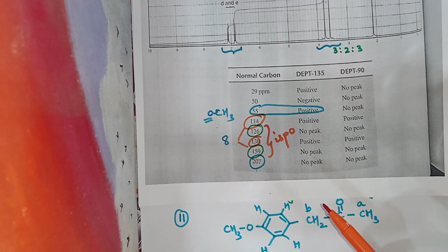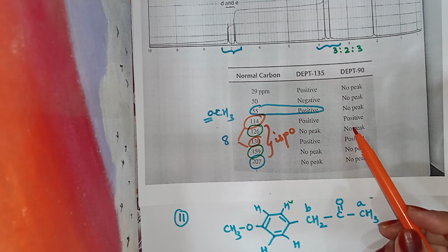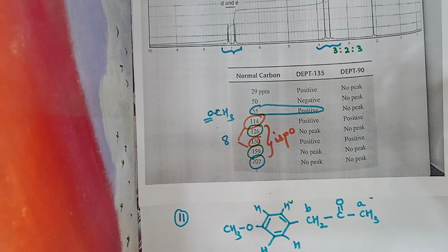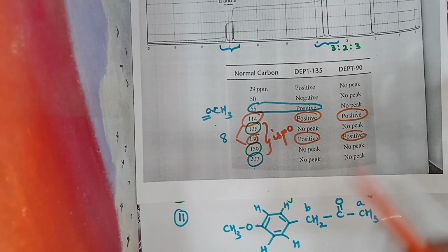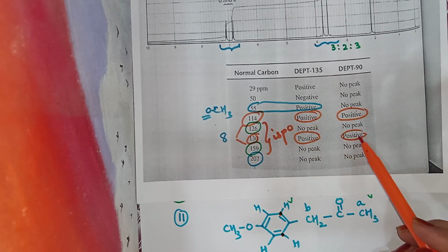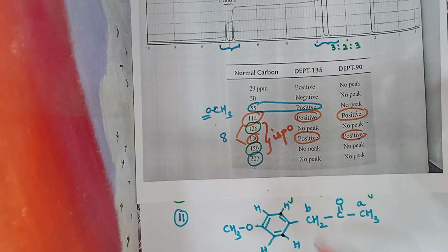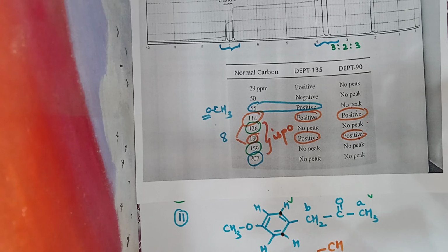The 2 carbon atoms D show peaks in both DEPT experiments, which confirms that they have attached protons, CH. Likewise, both carbon atoms at E have positive peaks in both the DEPT experiments, confirming the presence of CH.